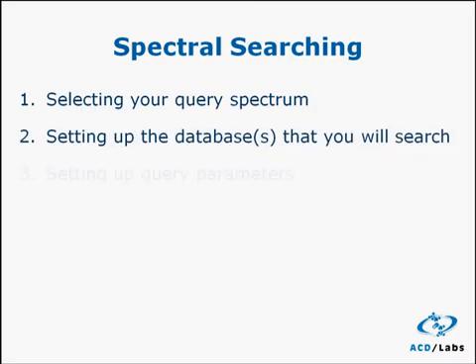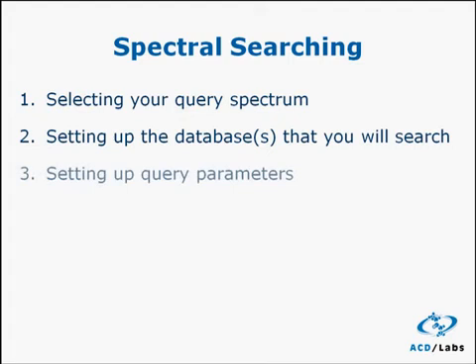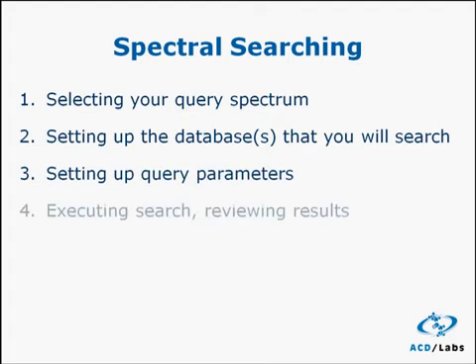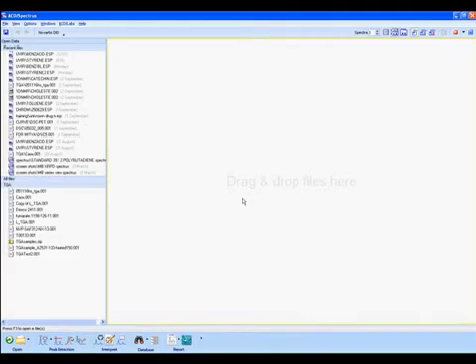Third, is setting up the query parameters, such as what search algorithm to use or a specific spectral range. Finally, you'll execute the search and review your results.